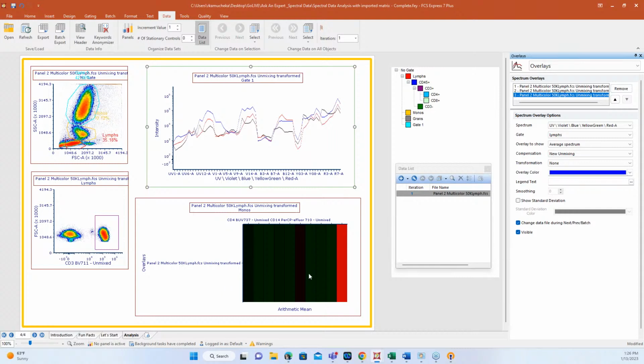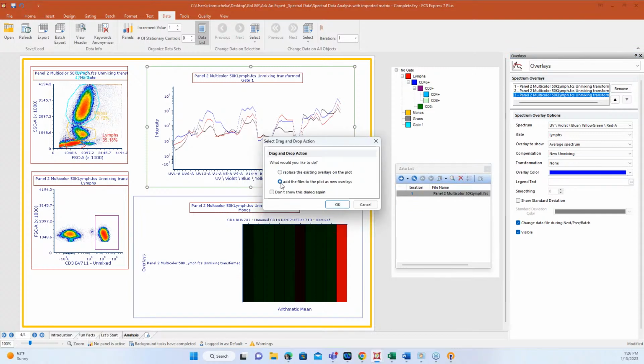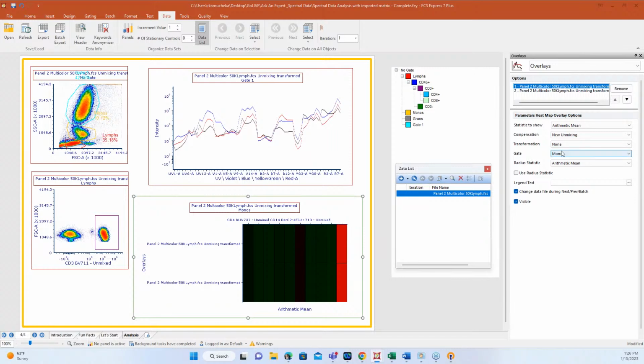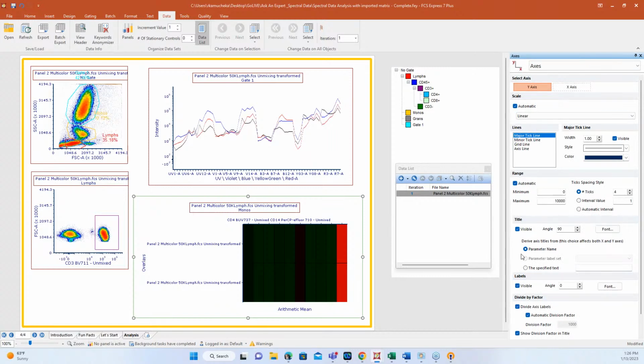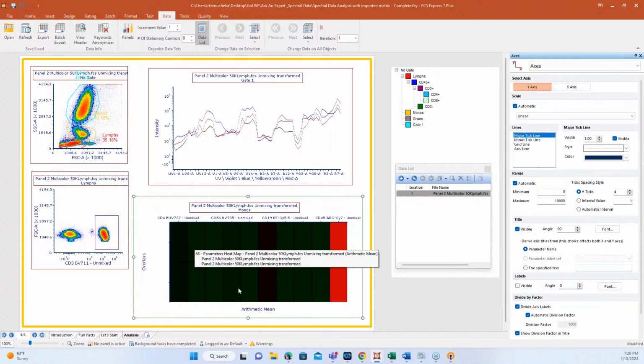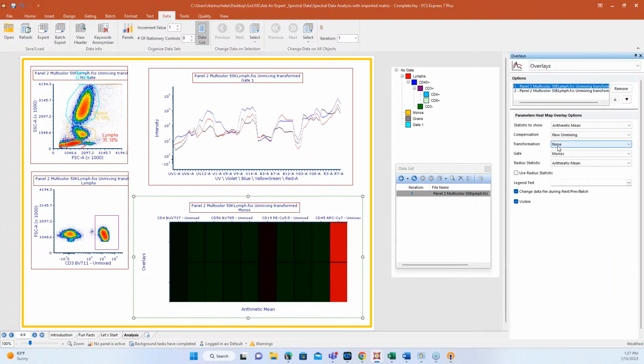Having the ability to compare things is my favorite thing. When you have these big panels and you have 40 different colors or a bunch of different things showing, being able to format things and make sure that you're getting the best visual is probably my favorite too. Right now I'm going to just take this off. We're looking at the same sample. But if I format this a little further, I can start telling the software what gate I want to look at. If I'm looking at the monos gate here, great. For the second sample, maybe I want to look at the gate one. We can keep dragging this on, and then we can start seeing on and off features from our data.